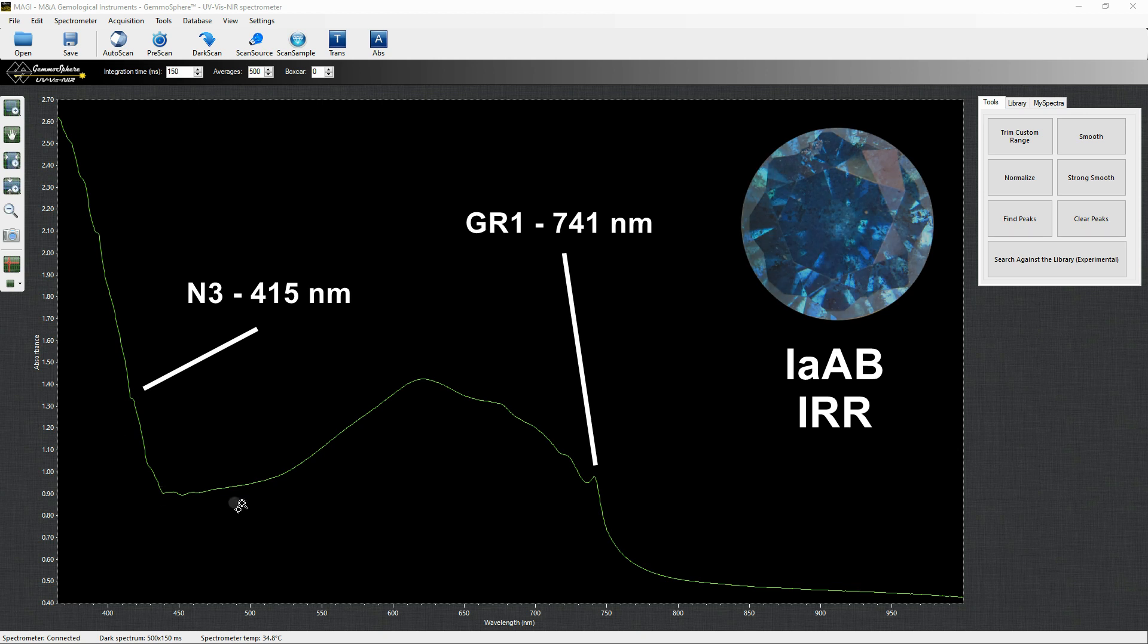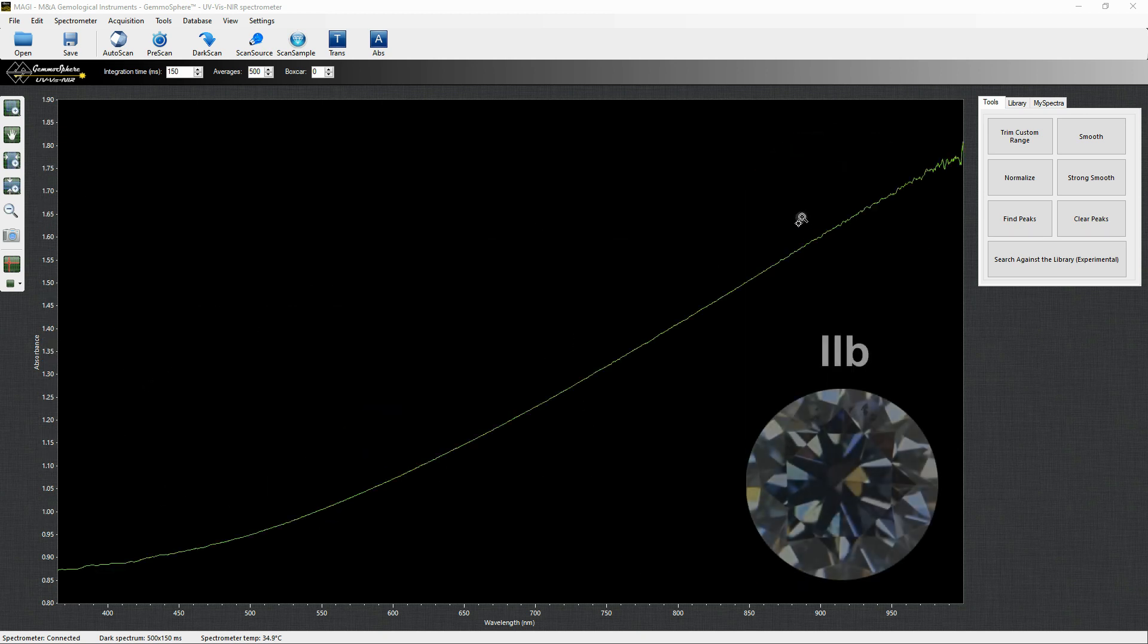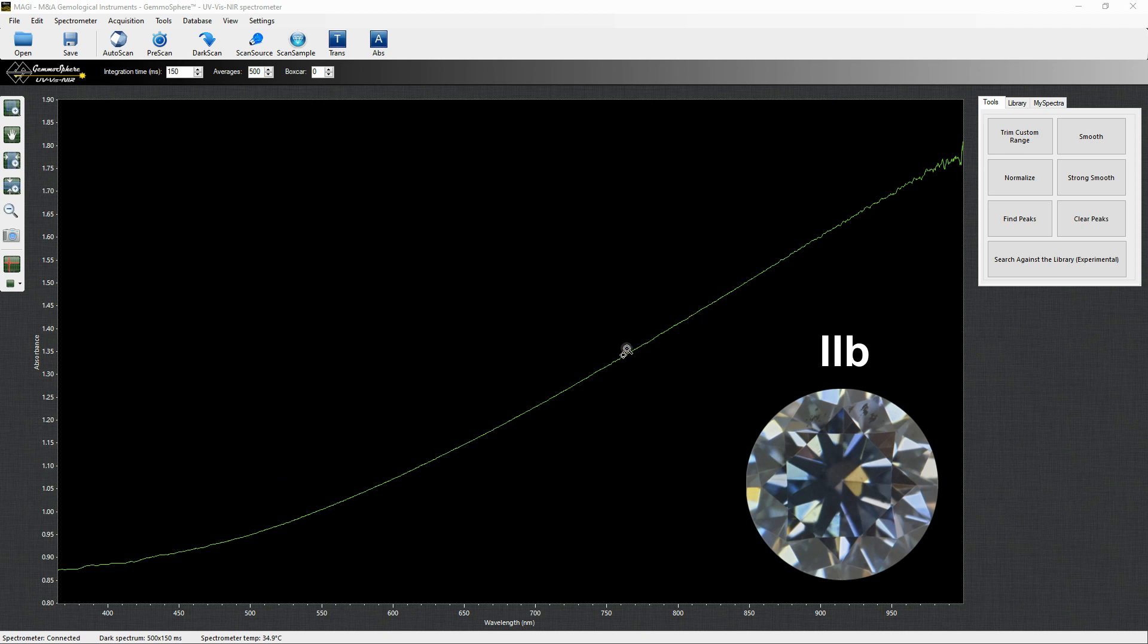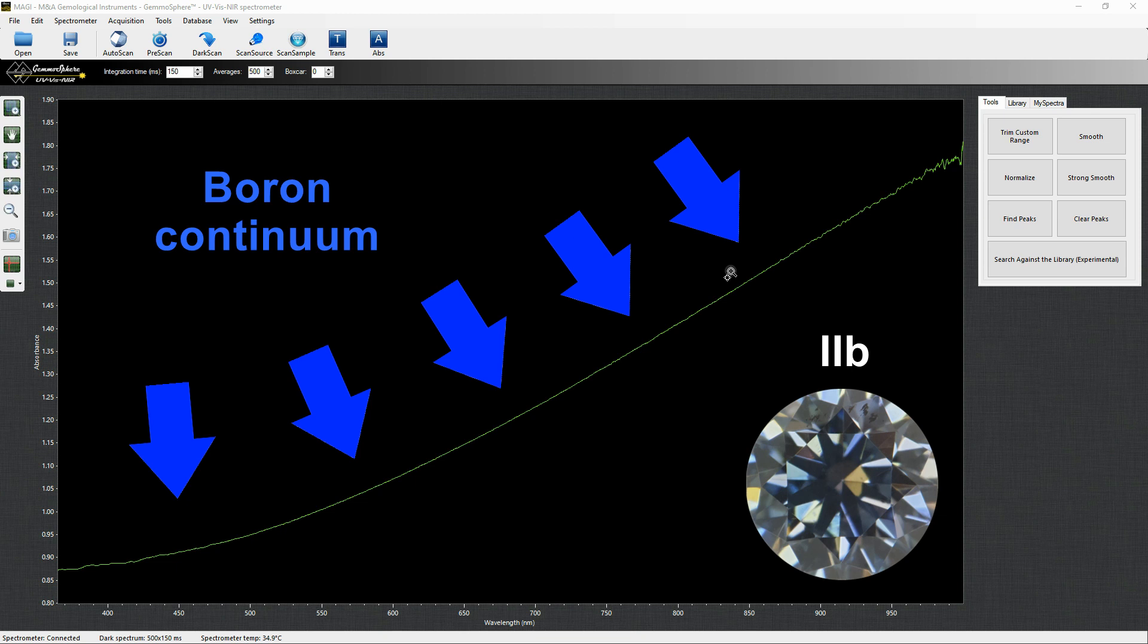HPHT synthetic blue are usually type IIb and their UV-Visnir spectrum displaying the boron continuum only is unfortunately not diagnostic of their synthetic origin.